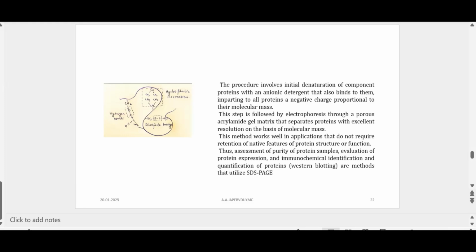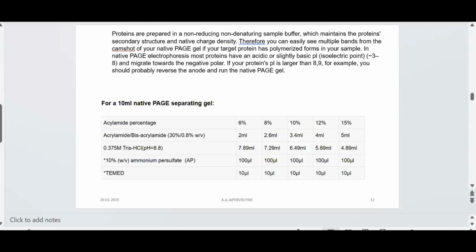If you consider, 1/10 of it is stacking gel. So the stacking gel is the one which is used for concentrating the protein in the particular gel, because for example here we had talked about the percentages of various materials that are used and the role of the stacking gel. I'm trying to reconnect you to that.